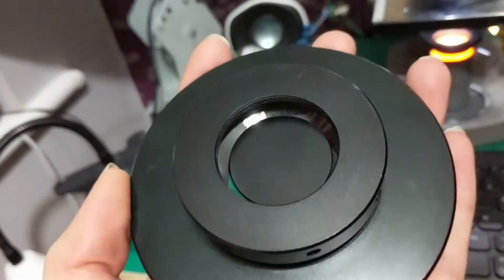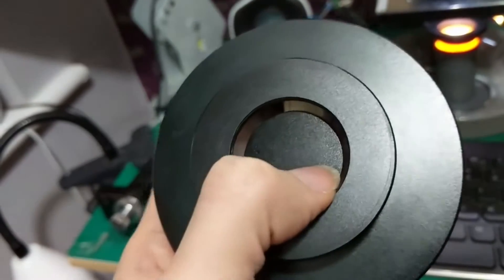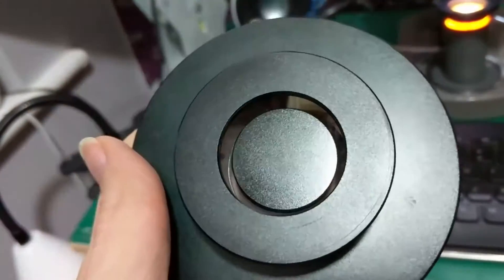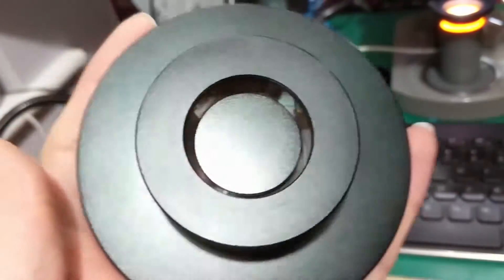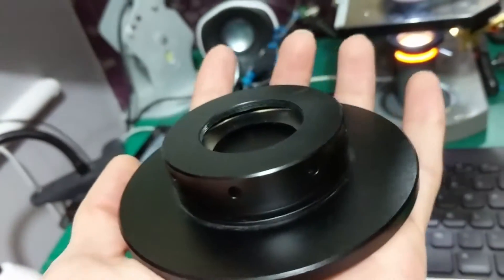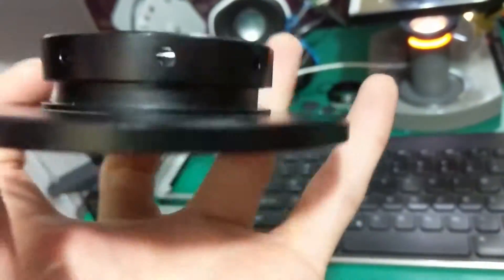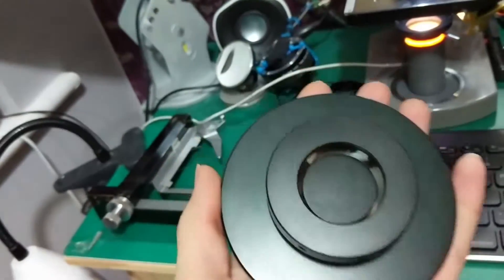It works really quite well. This bit I'm going to perhaps cover with a felt sticker to make it less reflective, which I think will give a better effect. But for £29.99 or whatever it was, it's really quite an impressive little bit of kit, and I'm going to see if I can do better myself.